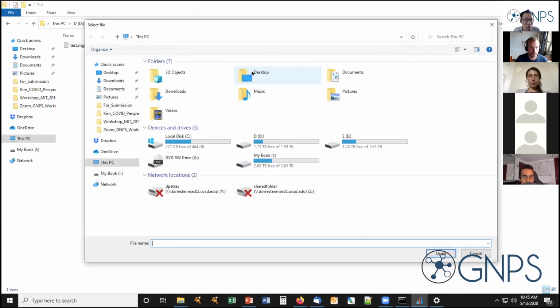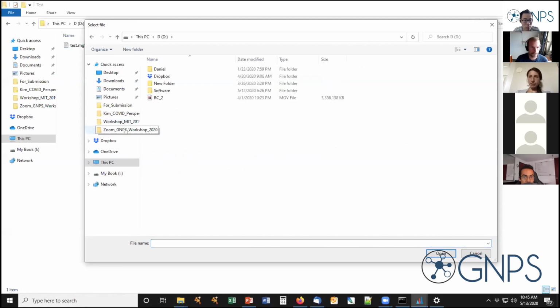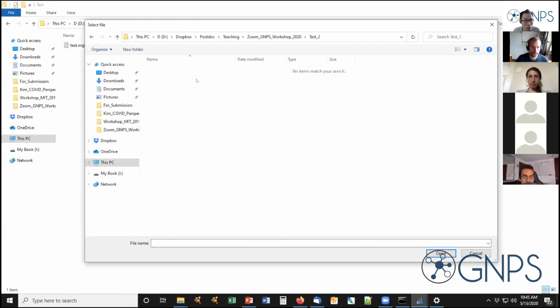Daniel, do you want to go through maybe what is the function of merge MS/MS, since it's like a newer development, I guess? I mean, we can talk about that, or we don't have to, but I think we're really getting close.